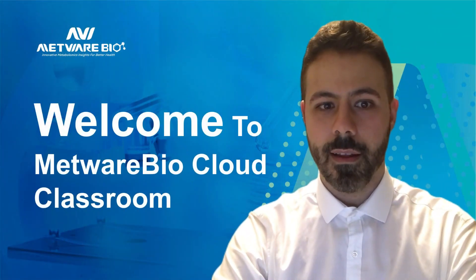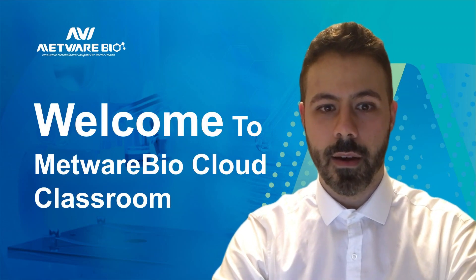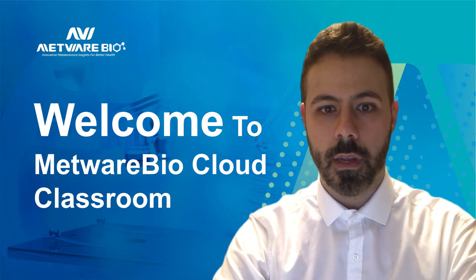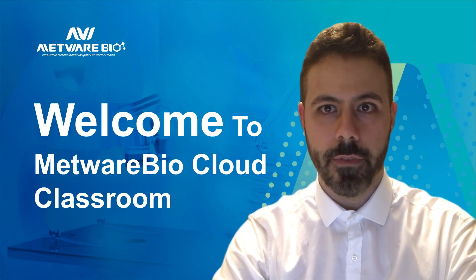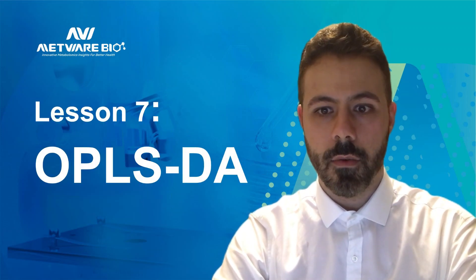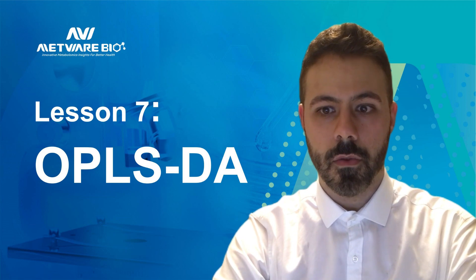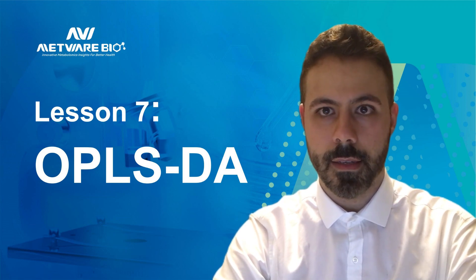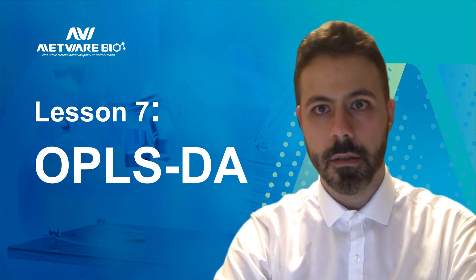Hello everyone, I'm Niccolò and welcome back to the METWARE tool video series. Today I will show you how to use the OPLS discriminant analysis tool.